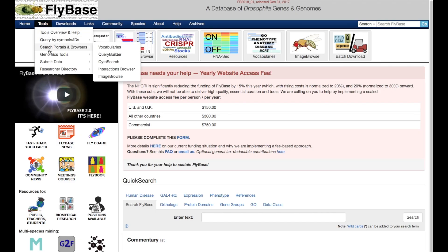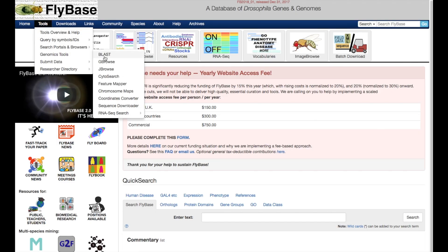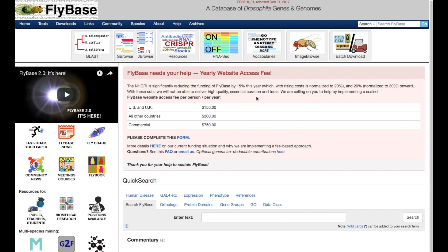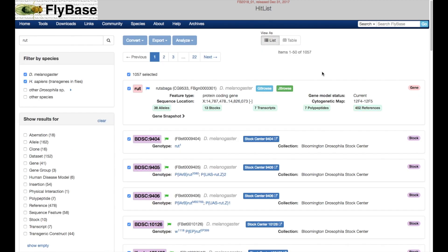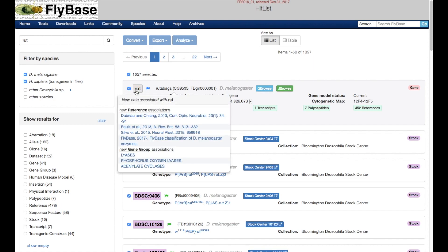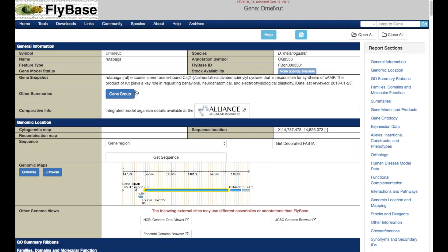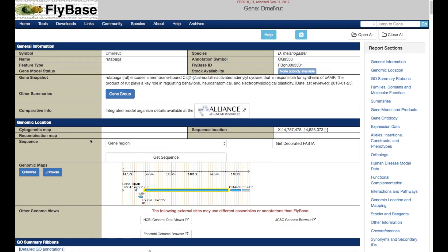JBrowse can be accessed in a variety of ways. You can navigate via the Tools menu, or click on the JBrowse button at the top of the homepage, or search FlyBase for a gene and directly click on the green JBrowse button. Finally, from a gene report page, you can click on the JBrowse button next to the genomic snapshot image.